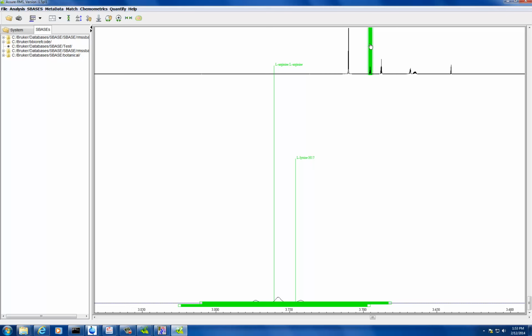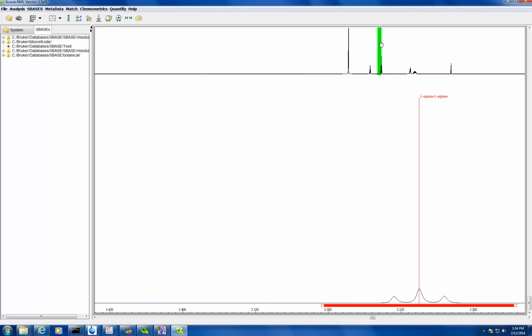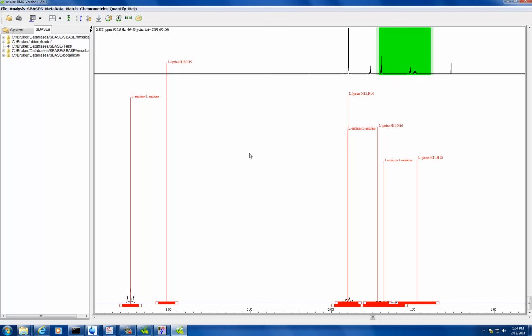If you move the mouse, you can go to an area where you can drag it. Yeah, so you can drag it, and not only that, move around the mouse. If you go here, you can take it and you can also make it bigger. Make it bigger again, by dragging that? Yeah, sure.